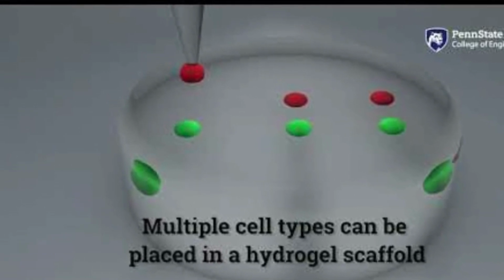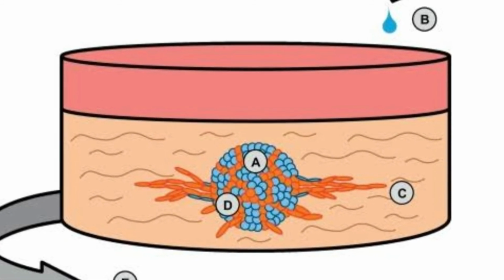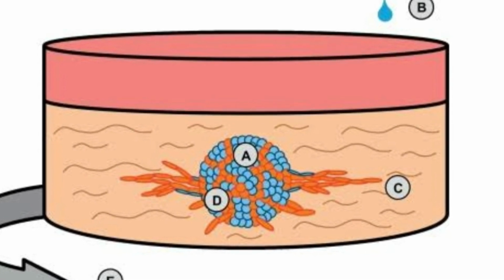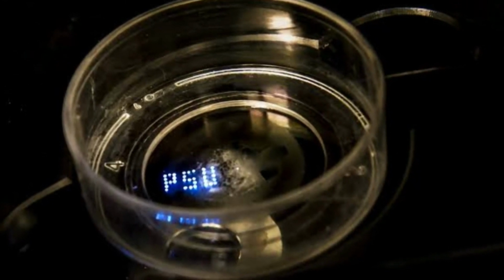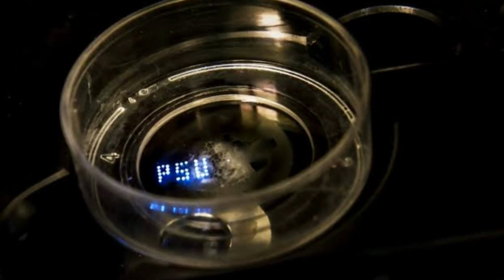They do note that the system still needs improvement to print spheroids in high throughput to create larger tissues in a shorter time. There may also be other, out-of-the-box uses for this system. Ozbolat suggests that bioprinting of electric eel electrocytes that produce an electric current might lead to living batteries.